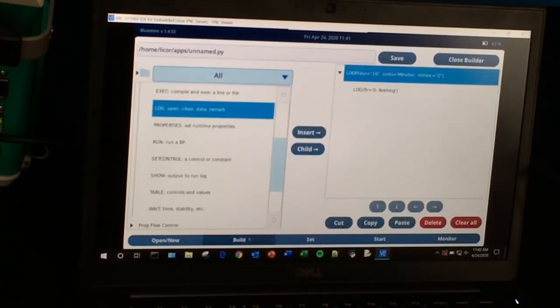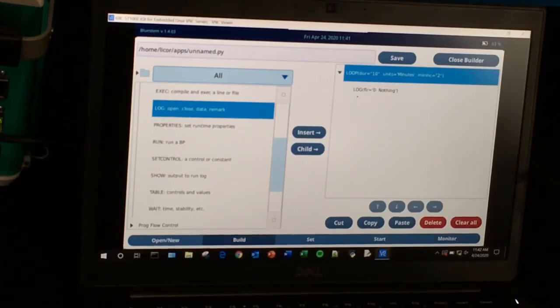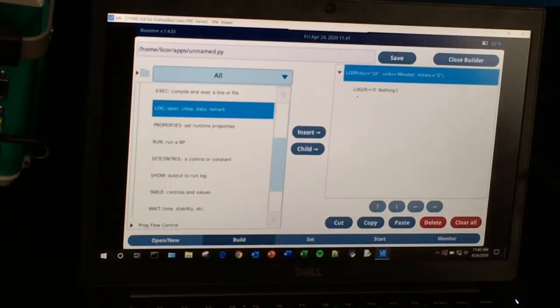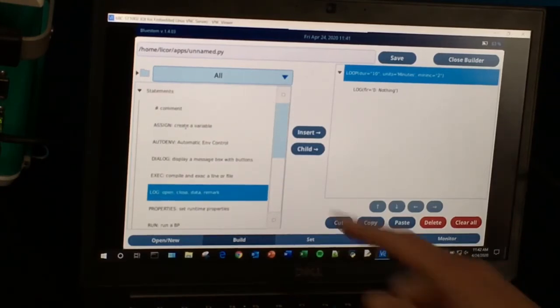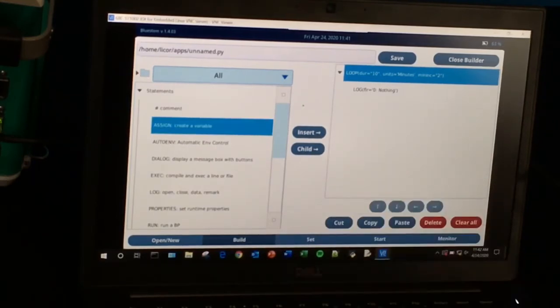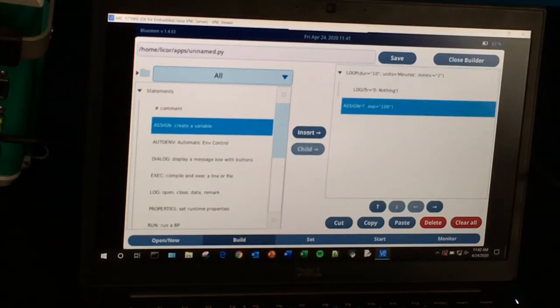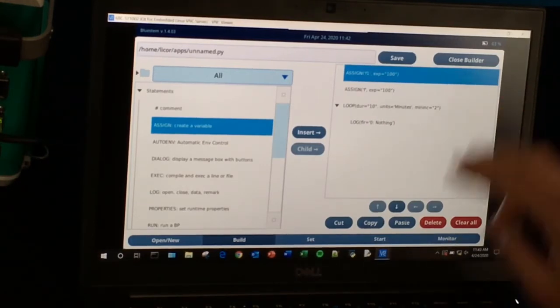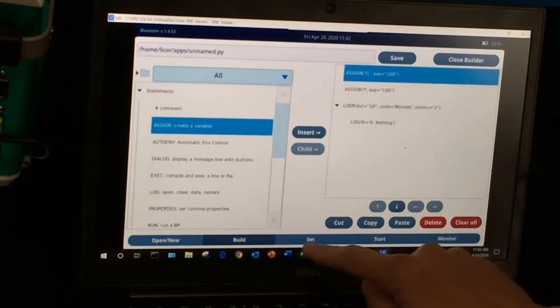Let's say we want to make this even fancier by adding a dialogue so that the user can select what the duration and log interval should be. We're going to add a dialogue and two variables — a duration variable and a log interval variable. I'll go up here and use the Assign statement to create these two variables, then click Insert and move the first one up to the top using the arrow button. I can copy that statement and paste it to create the second variable. Now I've created my two variables.